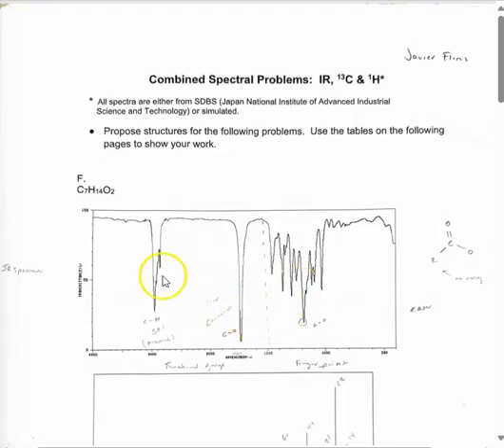The first peak that we see is this first functional group that appears to be at the 2900 marker. We know that this molecule will particularly have an sp3 carbon-hydrogen bond. The next functional group is right around the 1740 range, and this sharp peak is usually associated with a carbon double bonded to an oxygen.